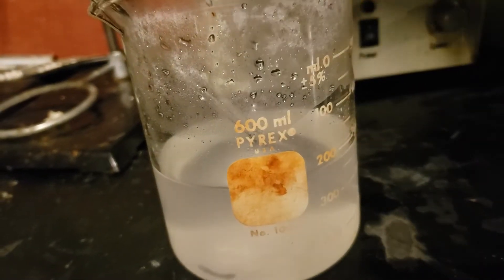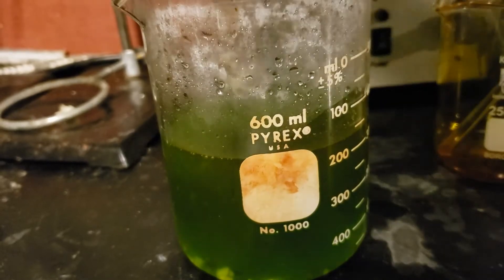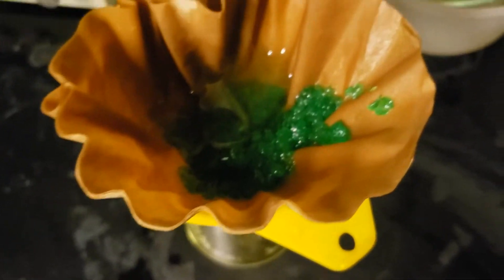In this video, we will be synthesizing potassium trioxalatoferrate-3 trihydrate, a beautifully crystalline green compound. This synthesis is often used as a demo in teaching laboratories in high school. Without further ado, let's get into the chemistry.